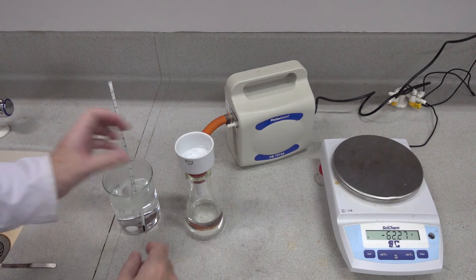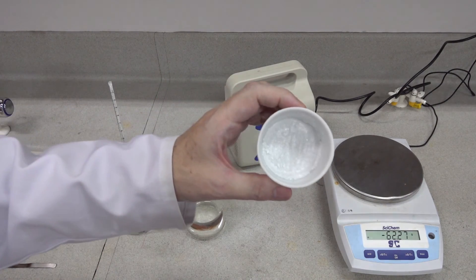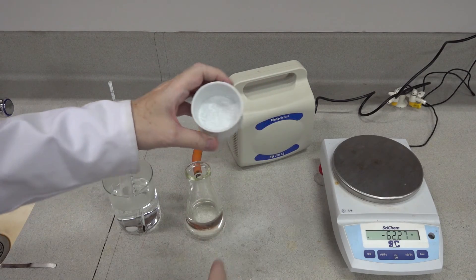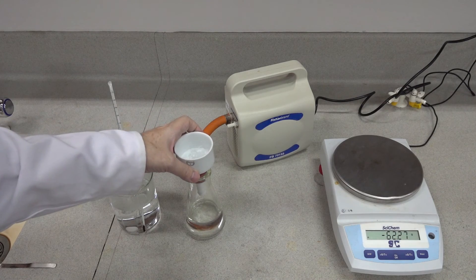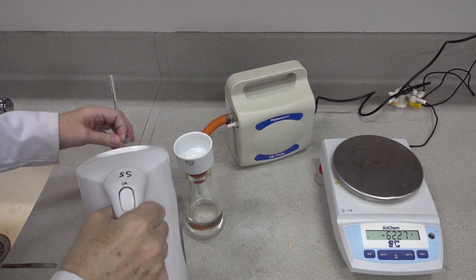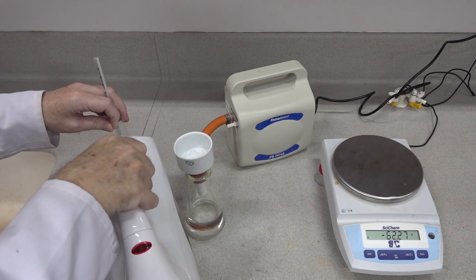You can see that we've removed most of the solid. You could probably spend a little time extracting a little more, but try not to scrape the filter paper. We'll simply increase the temperature of the water bath slightly.